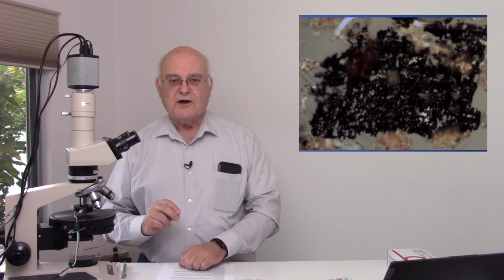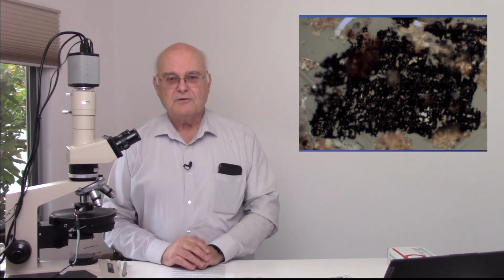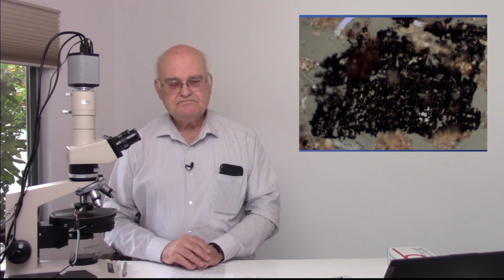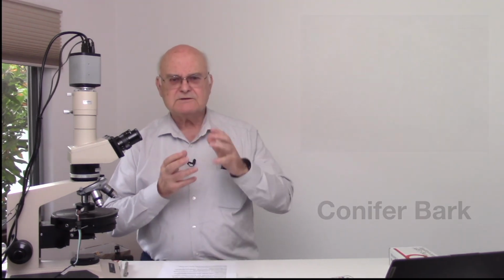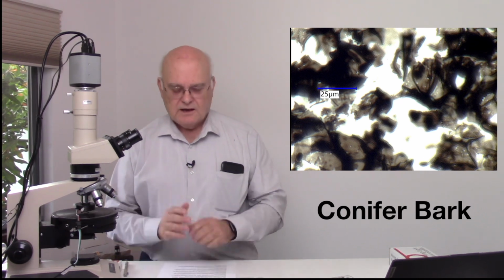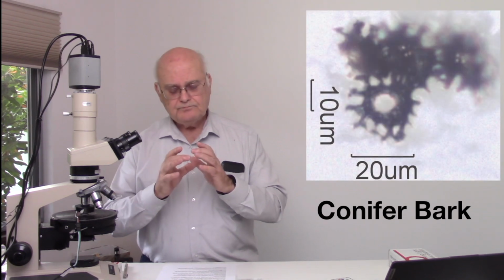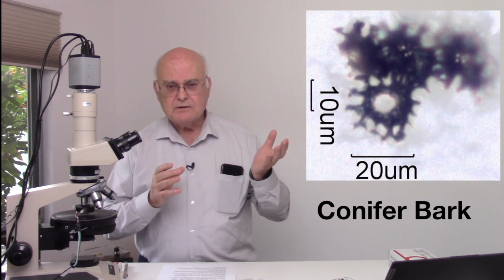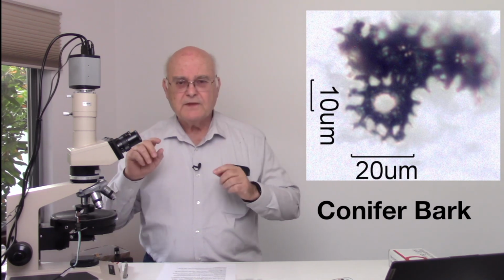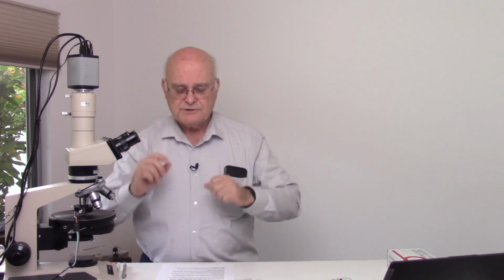Bark, quite often, is kind of a foamy looking material when you look at it under the microscope. A bunch of little bubbles, interesting structures. You'll have what are called hub and spoke structures, where you have a circular pattern with arms coming out from it that attach to other circular structures.